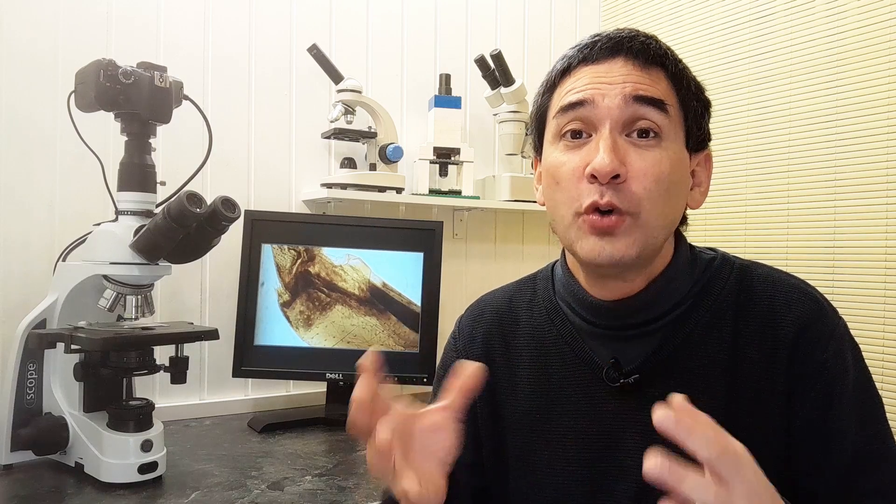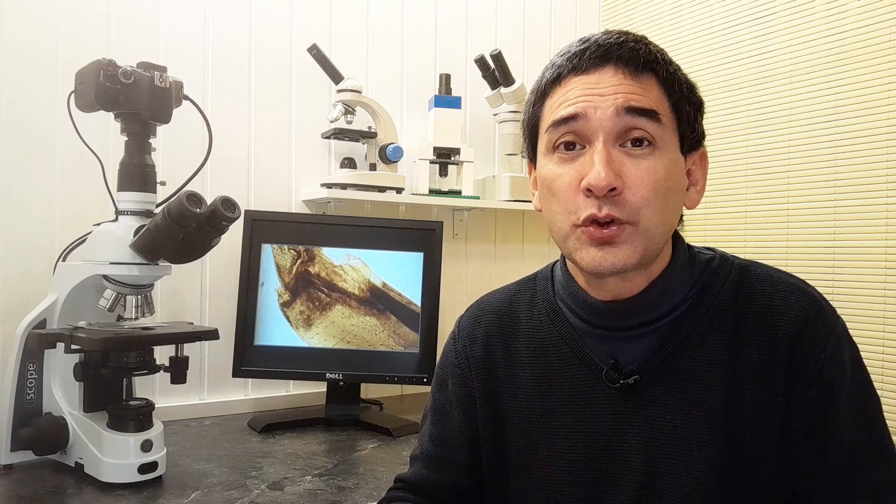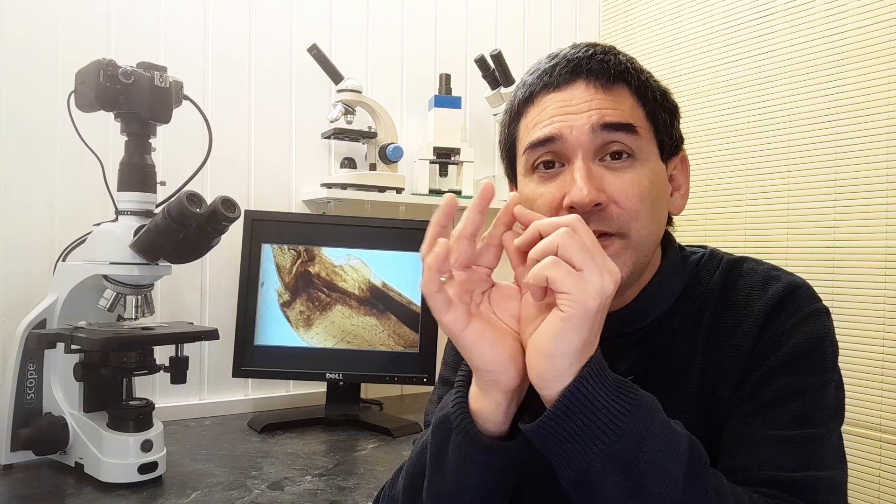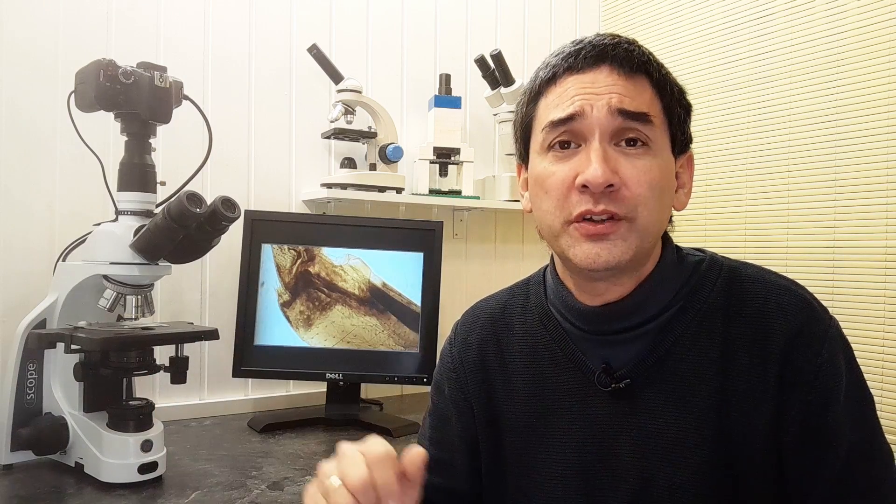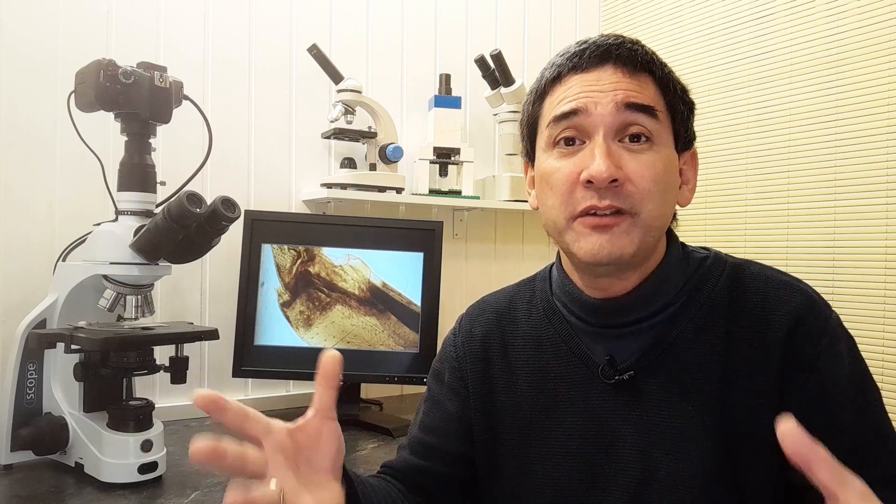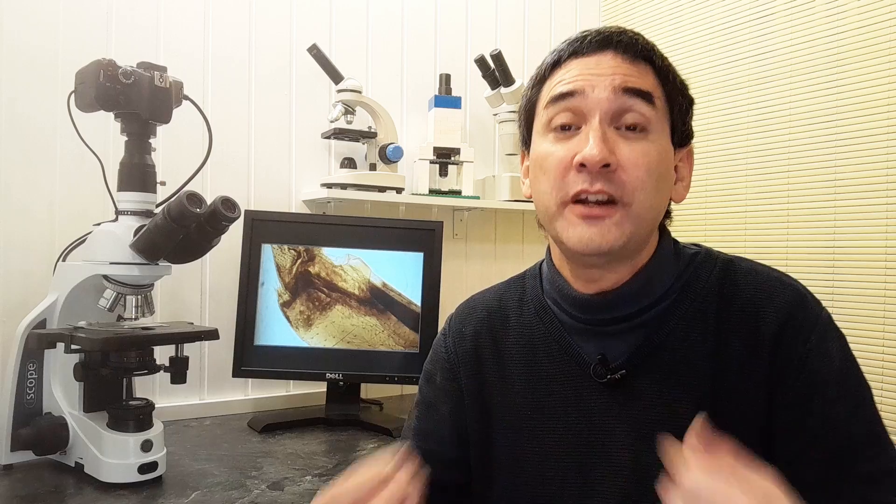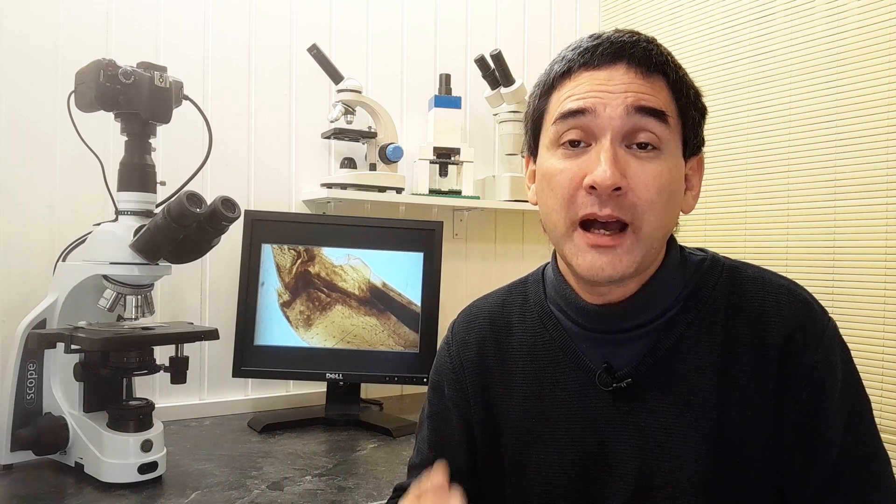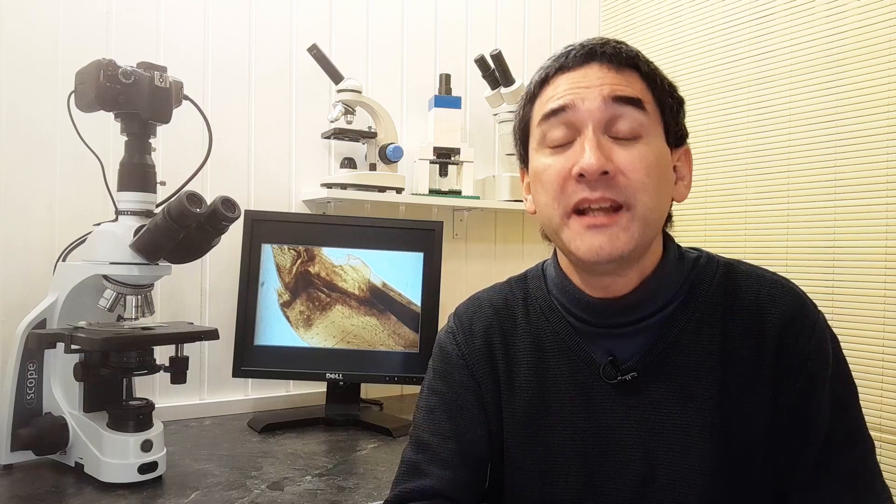And those large sensor cameras, of course, often also come with a large number of megapixels. So generally, what I would say is, there is no point in buying microscope cameras with a high number of megapixels. If the sensor is small, then the image quality is going to degrade. But I'm perfectly fine with having a large number of megapixels, high camera resolution, if the sensor is fairly large. So you have to see both actually in combination. And essentially, I think that very often, the large number of megapixels in a microscope camera sometimes is simply a spin-off, a side effect for having a large sensor.